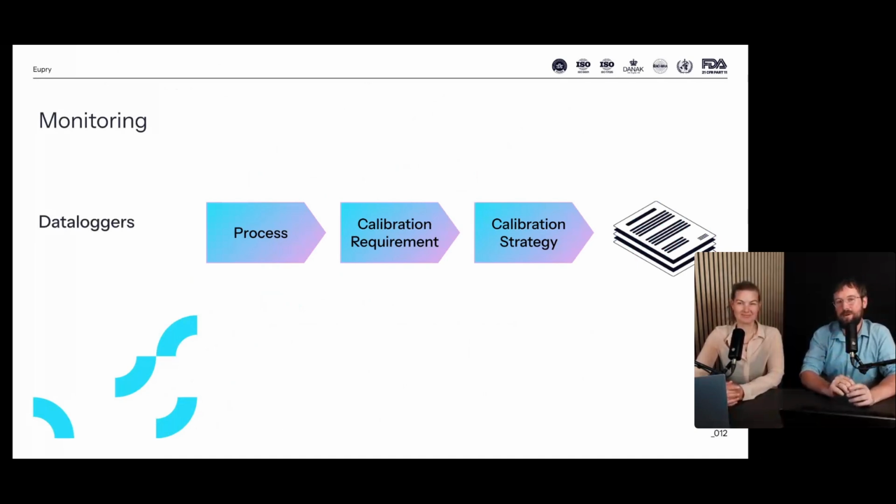And that will be my last point regarding calibration certificates. We also see some cases where there's a lack of review of calibration certificates. So it's a topic that I would say is not set in stone. Some auditors love to see that you've reviewed your calibration certificates, and others would just love to see that you've reviewed the request for calibration, thereby also confirming that the calibration certificates are in range. The best practice we often see is to also review the calibration certificates. Did the results show that you were in limits, and so forth? And did you get the calibration that you requested?